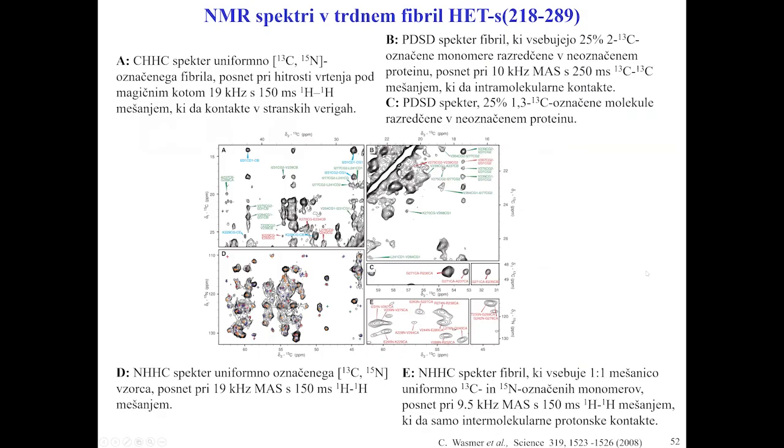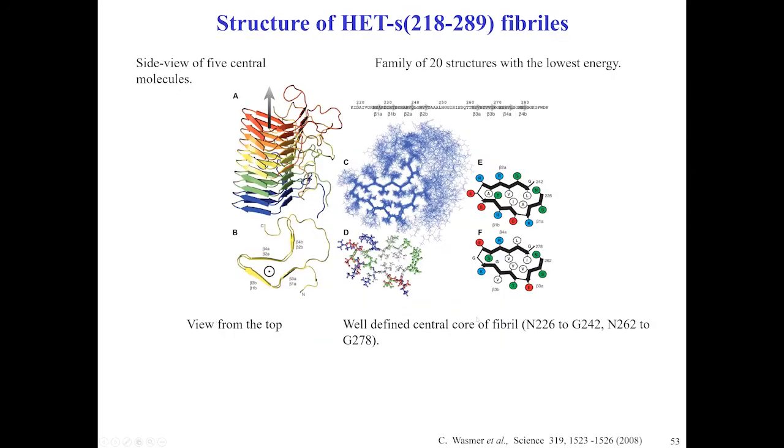A little note, oh sorry, this is also in Slovenian, but this was a big excitement. It's now a little bit more than 10 years ago when Professor Meier from ETH, for a piece of amyloid, was able to use solid state NMR experiments, only with quite a bit of isotopic labeling.